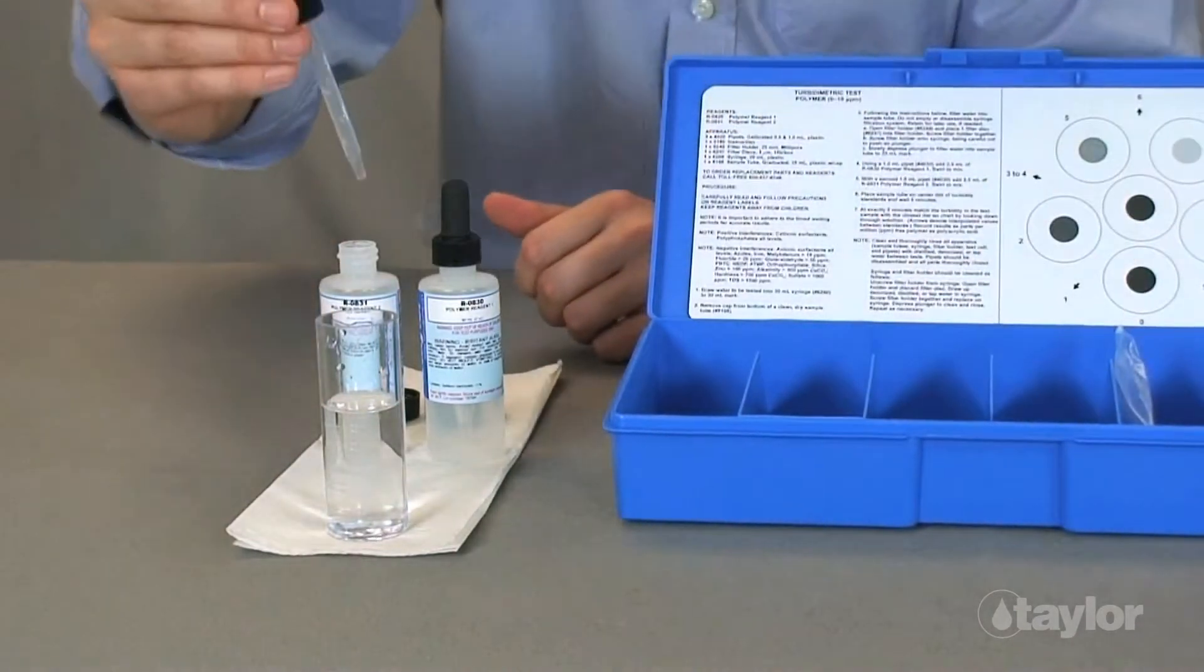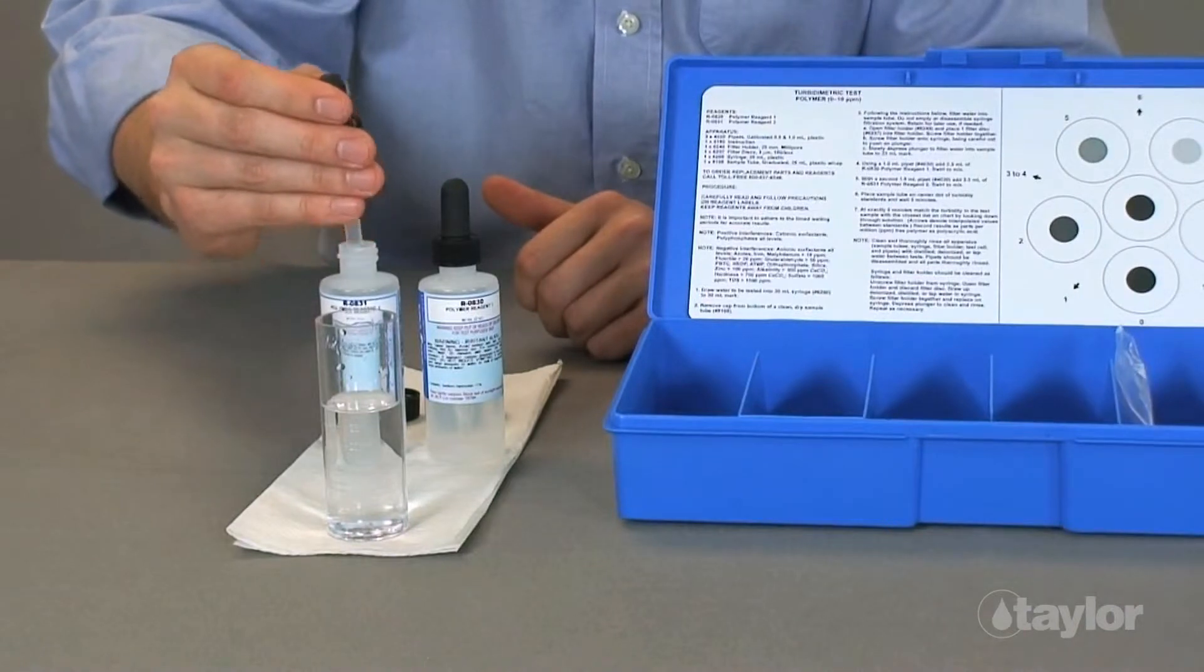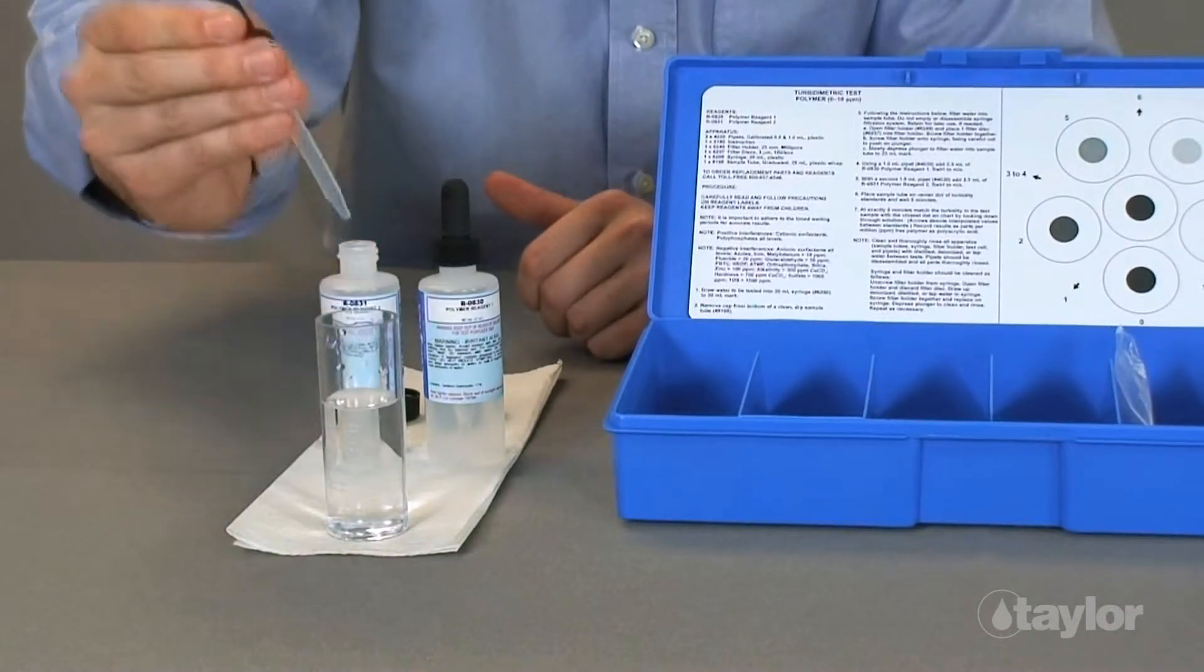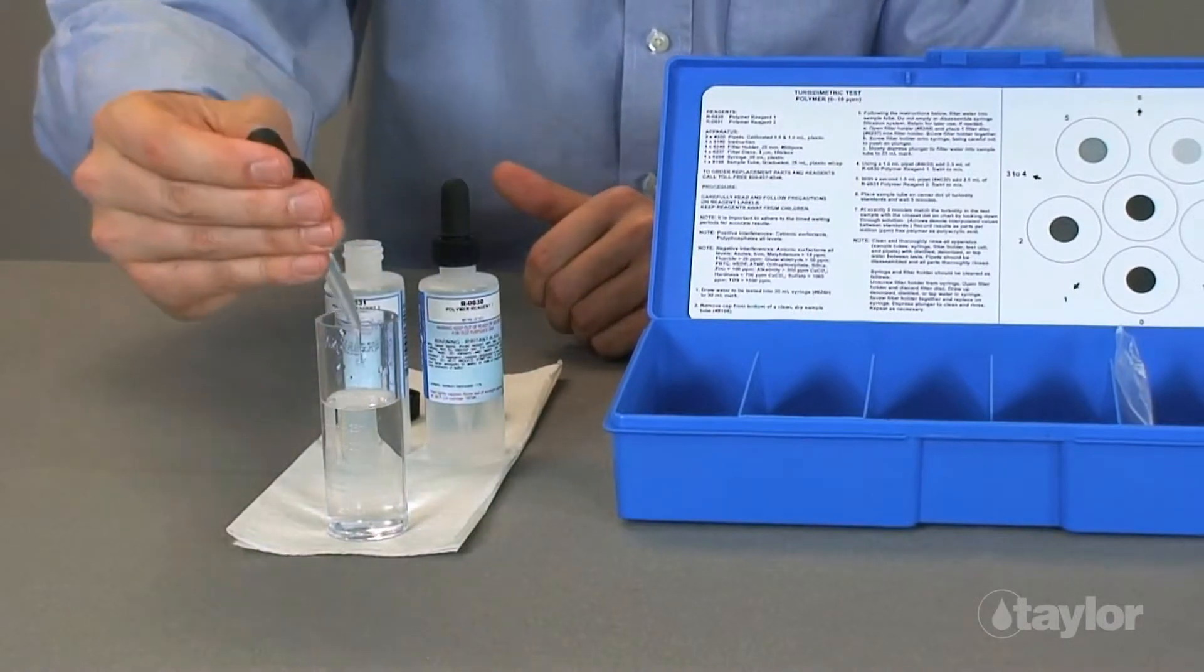With a second 1 milliliter pipette, add 2.5 milliliters of R0831 polymer agent. Swirl to mix well.